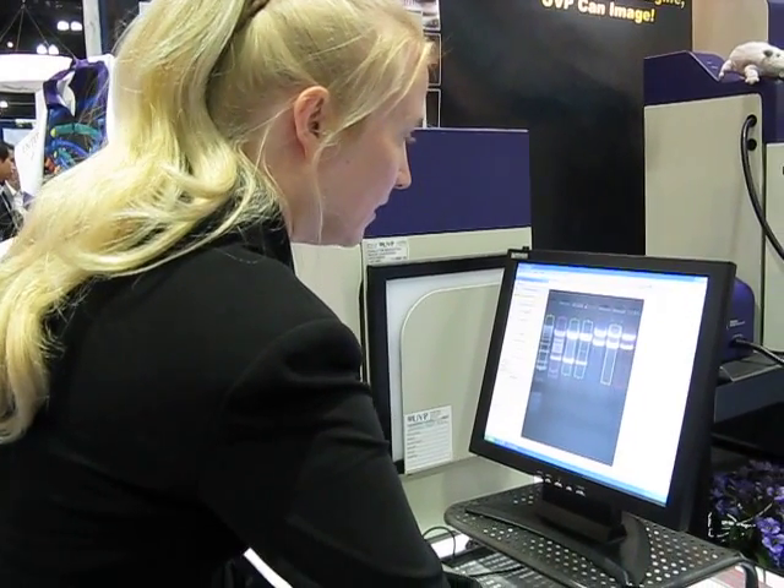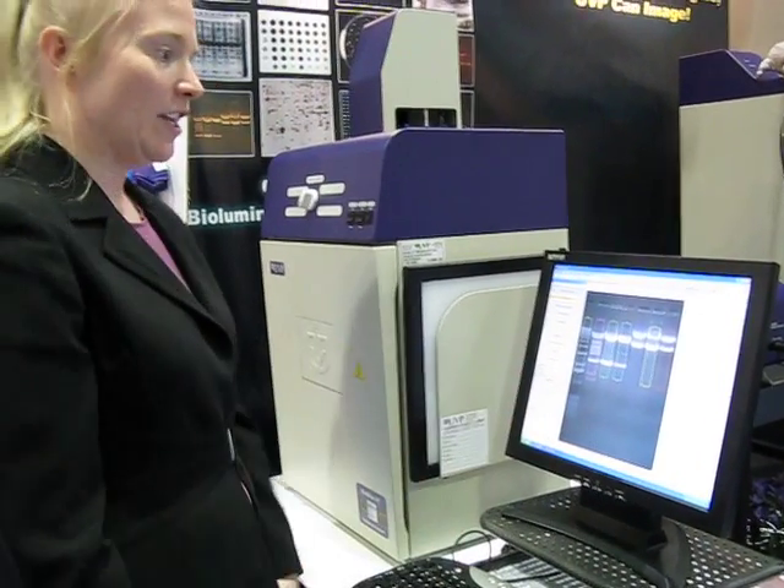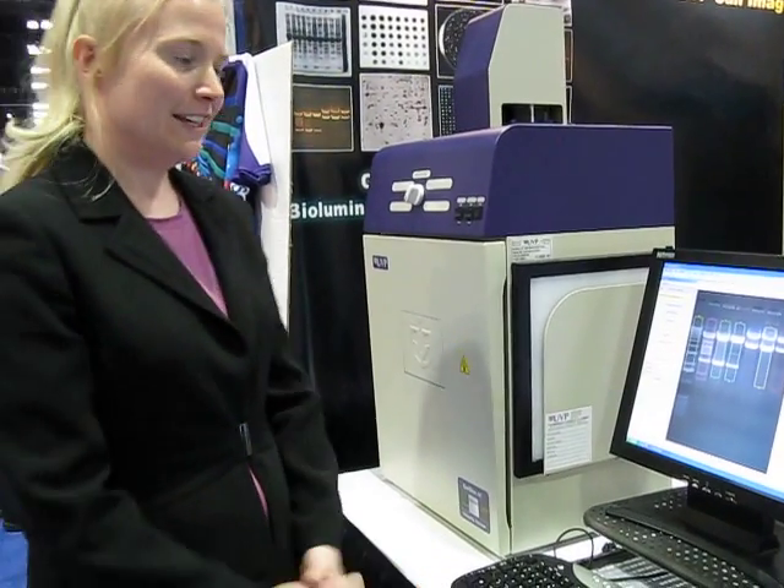When you're finished doing that, select OK and you have everything selected for you. Again, when you're in the market for any kind of gel imager, think of UVP.